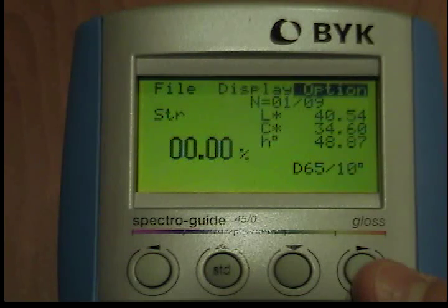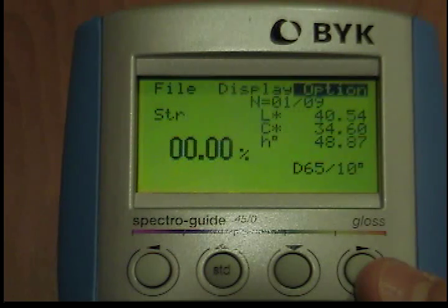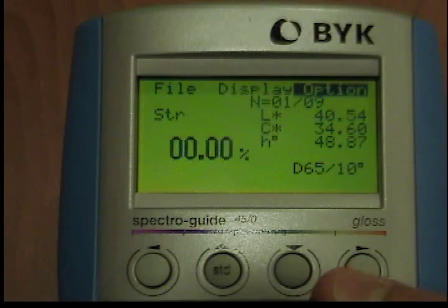F520: the index following the F indicates the wavelength with the maximum absorption. This is automatically displayed by the instrument.